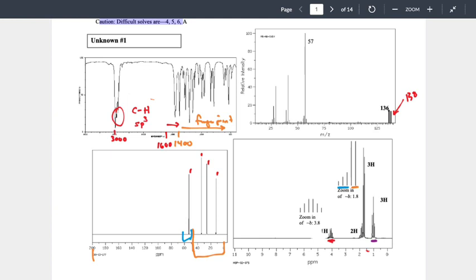The chemical shift is where the signal appears. Okay? So I've got my red, blue, orange, and purple. The red signal shows up to me about 4. The blue shows up, kind of a hard one, we'll call that 1.9. The orange we'll call 1.8, and the purple we'll call 1.